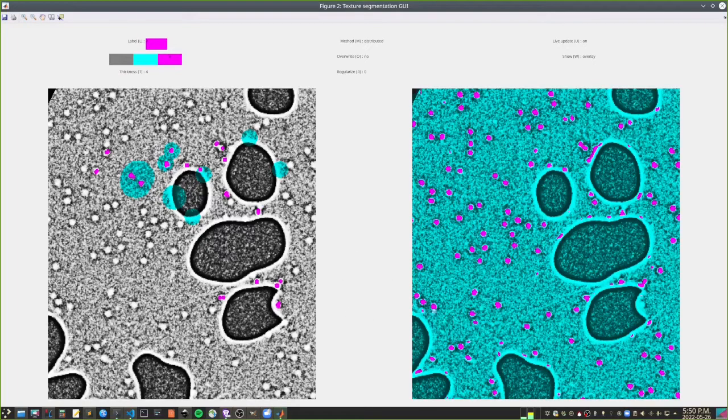Okay, so this is starting to be acceptable. Probably improve it just a little bit. Quite good. The thing is, if it finds the majority of the fibers and also the complete region, it's going to give you a better estimate of the fiber volume fraction. Oh yeah, true. So it's worth spending a little bit of effort here.